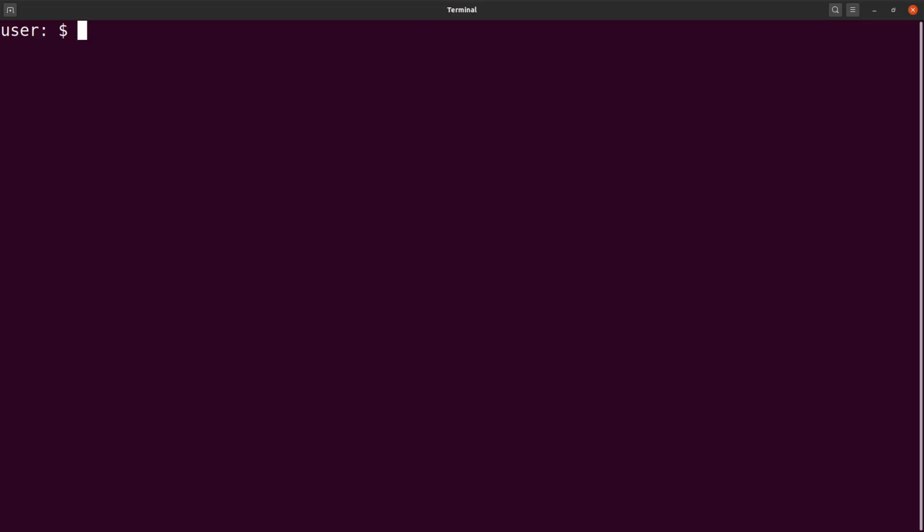Once you have this download link, you move to the terminal and continue from there. On the terminal, the first thing I will do is create a working directory. So I will say mkdir VCFs and then cd to it. The reason I do this is to separate files that I'll be generating for this exercise from other files on my PC. Doing this helps you to organize your files and prevent accidental removal and modification of files. That is why I create directories for every project that I do.